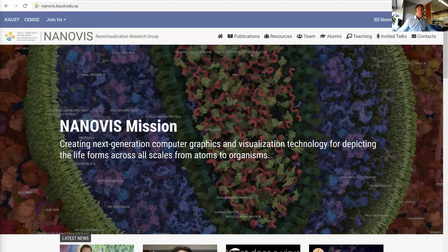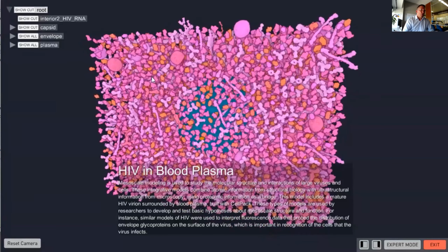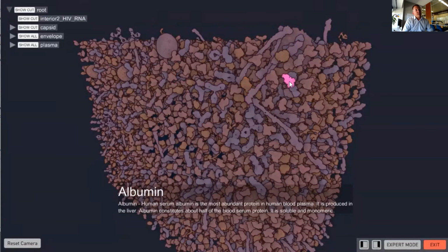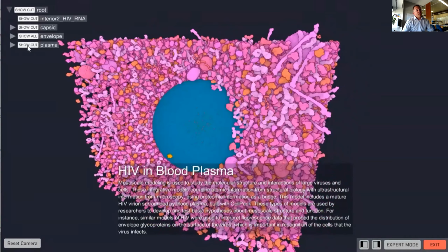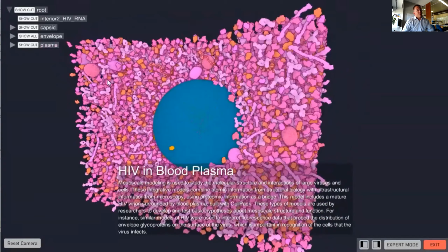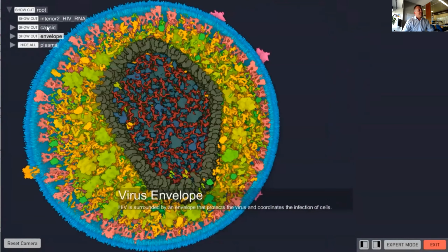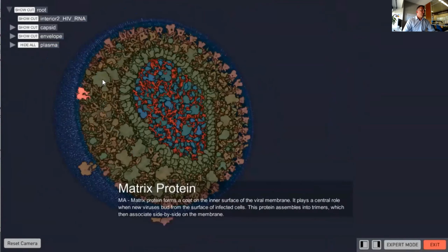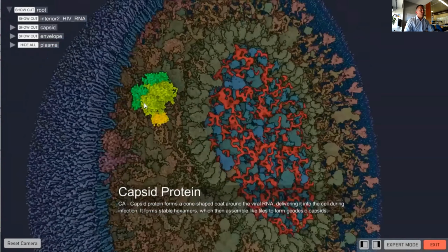All this is available. Before we started to focus on the cryo-electron tomography, we have worked on visualization and rendering topics of what we call mesoscale models, which are models of 100 millions of atoms, and they form ultrastructure of viruses and of their surroundings.